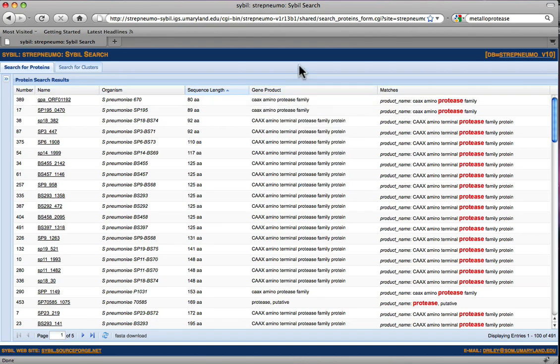Columns can be rearranged by clicking and dragging the column header left or right, and releasing when the blue indicator arrows appear in the desired location.